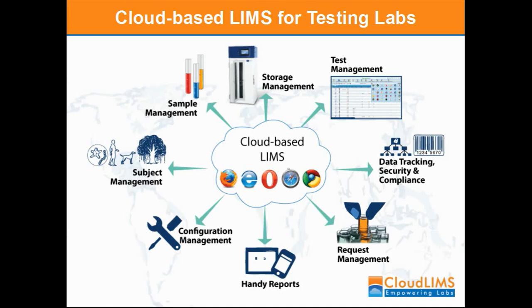Managing lab data and meeting the regulatory requirements can be challenging, time consuming, and tedious. A cost-effective cloud-based LIMS seamlessly aids testing labs in managing big data, automating lab workflows, and in meeting regulatory compliance, thereby saving time, cost, and resources.